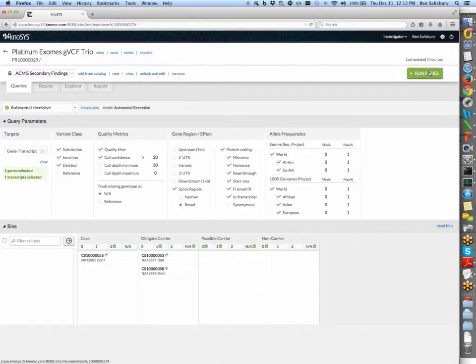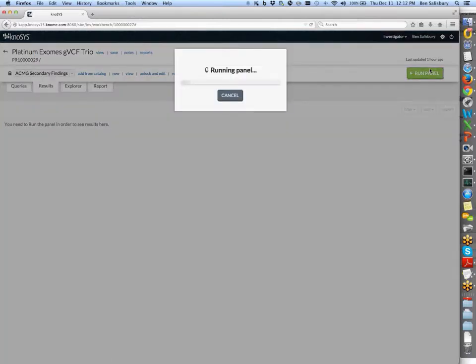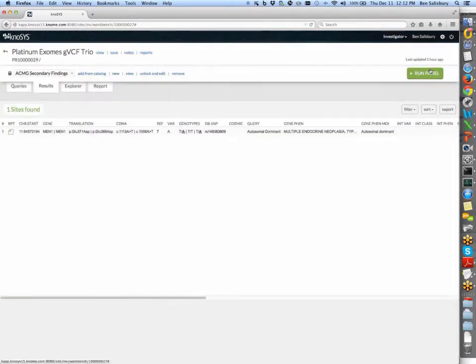But we can just go ahead and run this panel, and what it's going to do is execute all 5 queries, and it will give us results that are found in any of them. And out of all those 56 genes, we're left with only a single variant of interest. Everything else has been filtered out as too common, or not a protein alteration, or not found in these genes at all. There's nothing stopping you from doing a broader search. This panel has just been created as a narrow one.